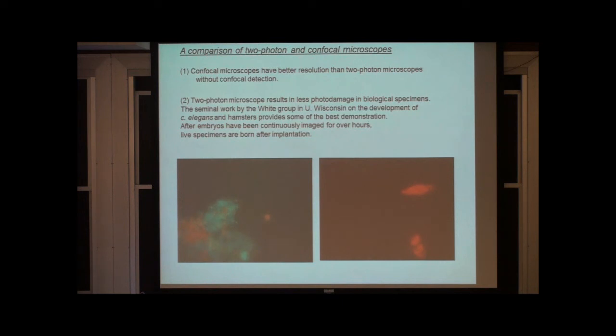But you can see the euglena start not to move so well. In fact, the euglena start becoming round. Cell rounding is generally bad. And also the movement almost ceases. Everything is in real time. If you turn the light back on, the euglena is, I would say, dead at this point.